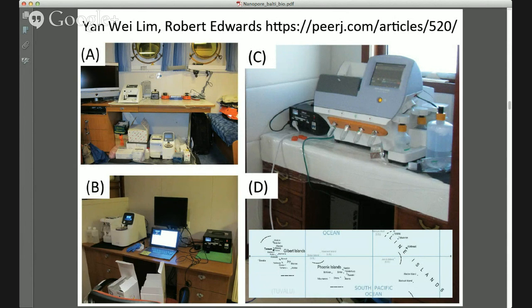And the reason that he gives for that in the paper is that they can look at the results of sequencing genomes and sequencing microbiomes, and they can act on those results, and it can inform how they do their sampling and what experiments they're going to do next. I tend to think it's probably just because they wanted to put an Ion Torrent on a boat. So portable sequencing, if you can call that portable, is already a thing.